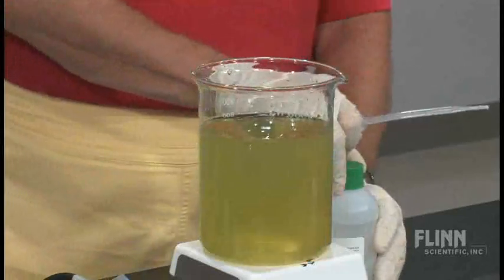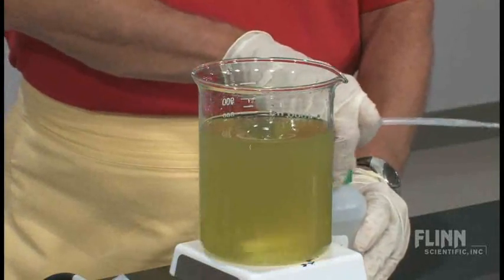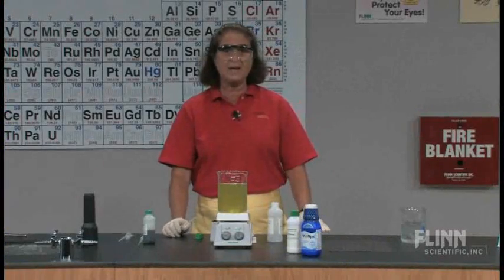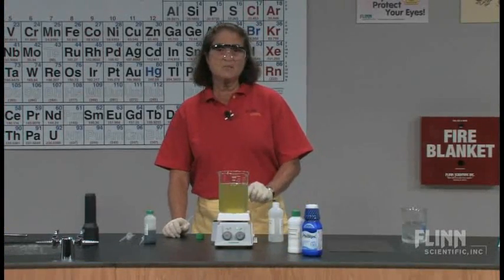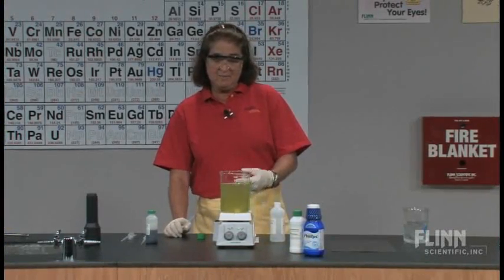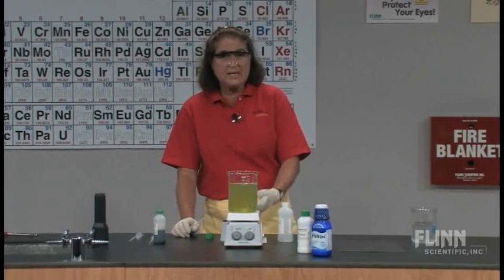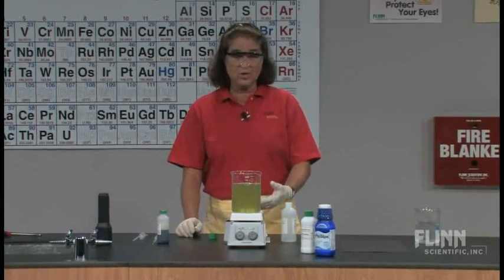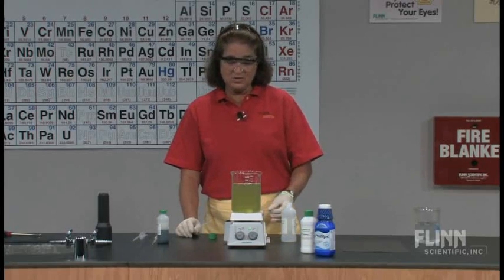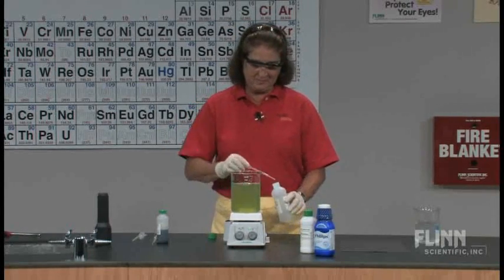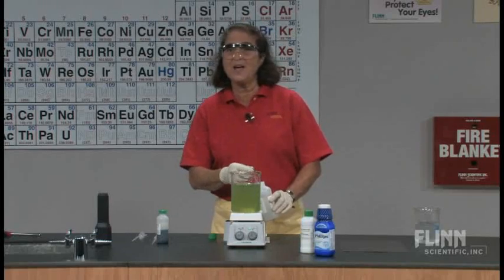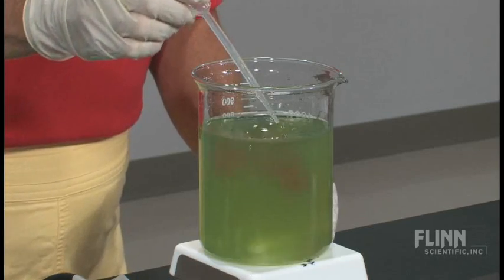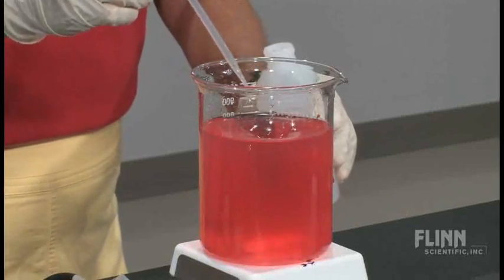I'm going to do this one last time. I'm going to let it stir just a little bit more — see if we can get it to go back to the green. As long as there's magnesium hydroxide here, it may take a little bit; more magnesium hydroxide dissolving slowly. It will return to the blue and perhaps even to the purple. But at some point, you're going to add too much of the acid.